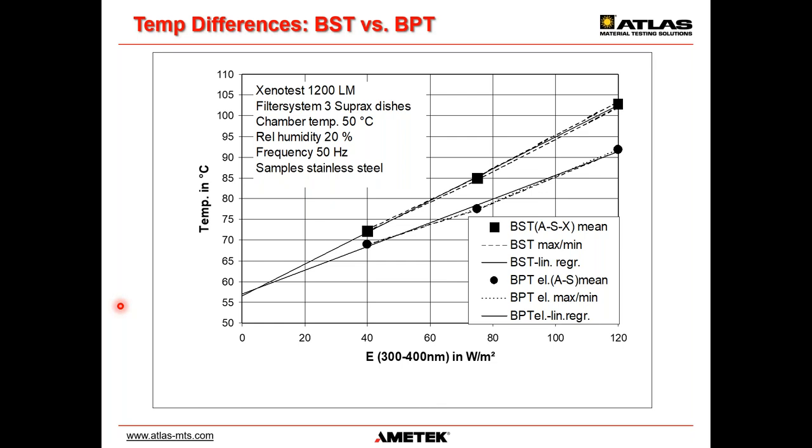And when you want to compare the results from two different locations, maybe your German and your American colleagues want to run the same test method and they don't see the same test results, that can be due to a different black panel temperature sensor in one of those instruments. So make sure you get the black panel temperature right for whatever test you intend to run.